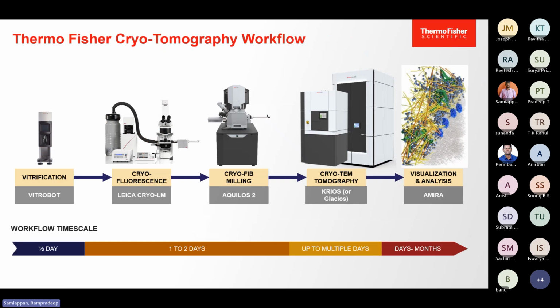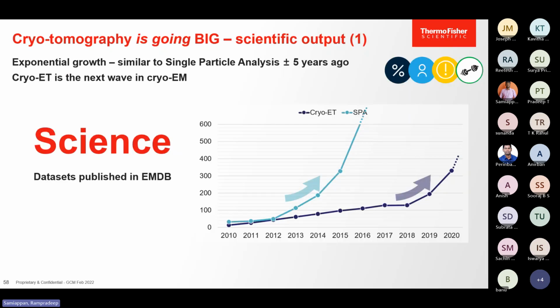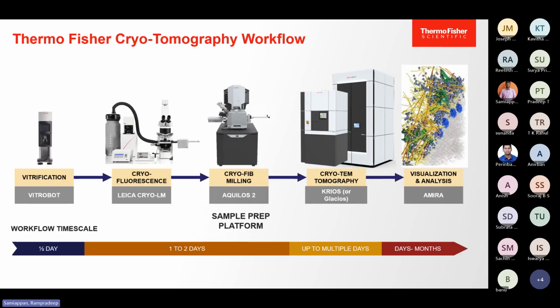And I think over a period of time, micro-ED is also coming up. So there are a lot of other methods booming up. But irrespective of the technique, the principle behind it is the same. We need to answer a biological question irrespective of whatever technique we use.